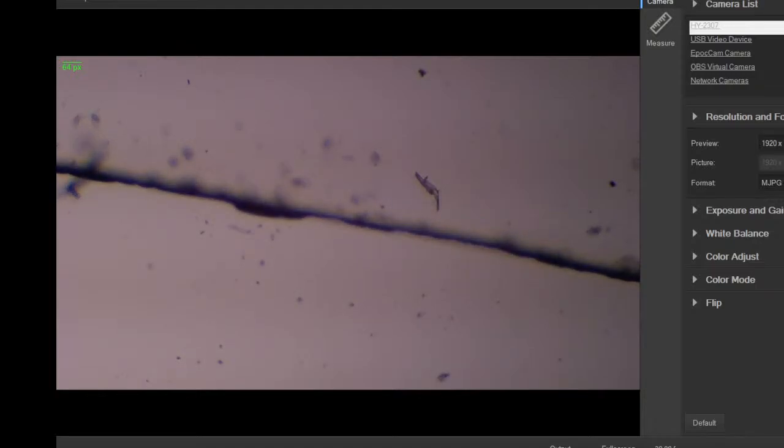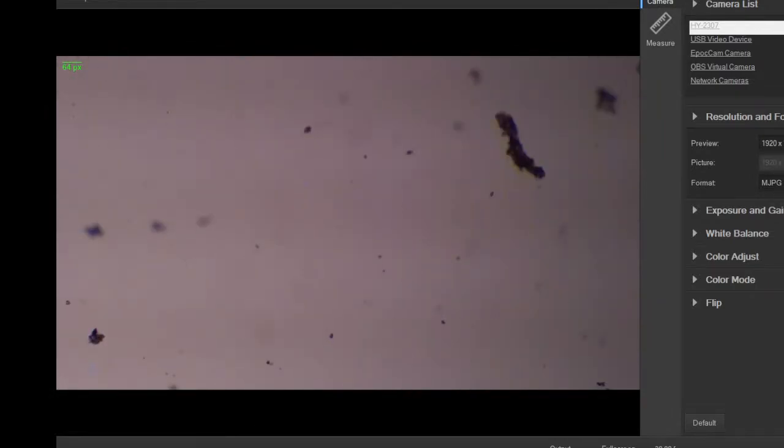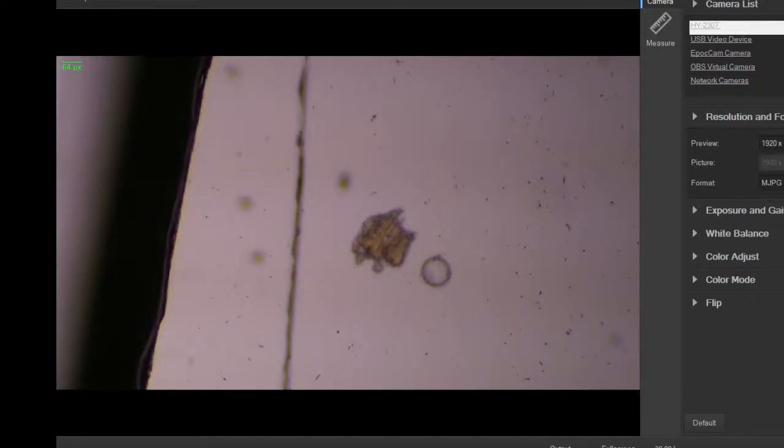Still nothing. Still nothing. Well, that's too bad. More chunk of material there.